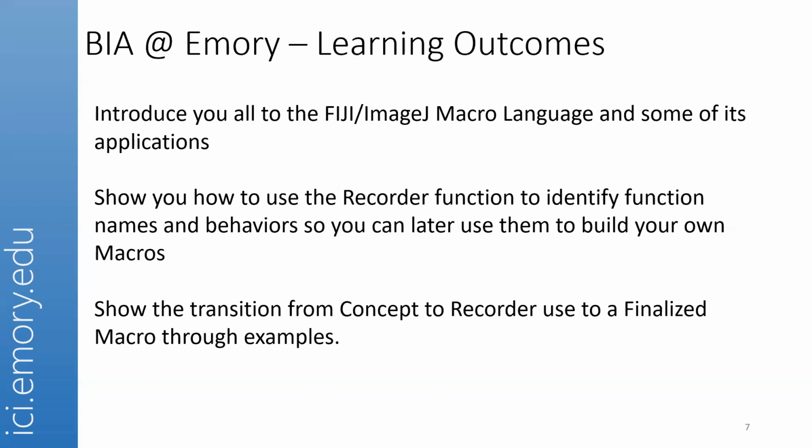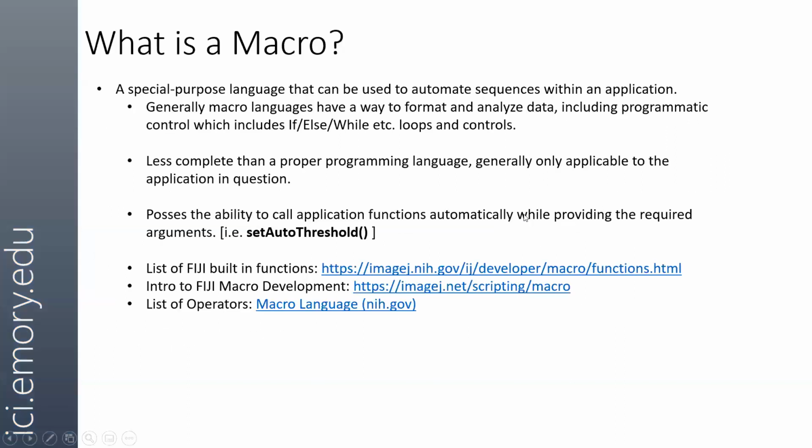It'll be relatively small, but it'll go from concept to execution in this talk. And that's useful. It's like writing a paper. We'll start with the outline and then go till the finished draft.